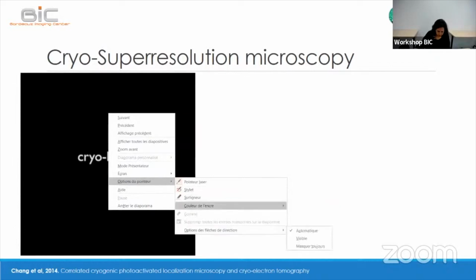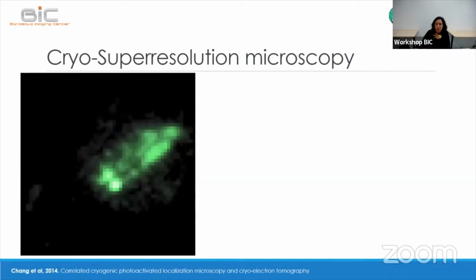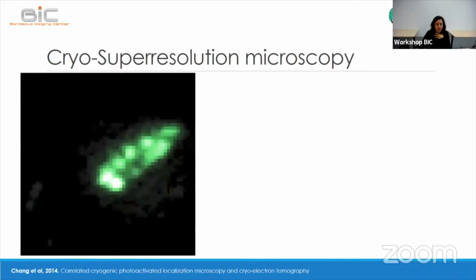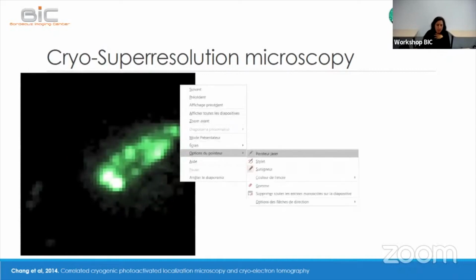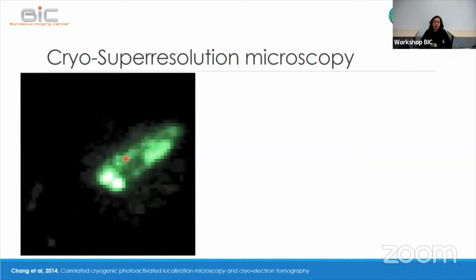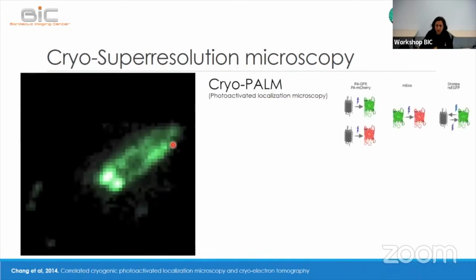No, I cannot control the video. So anyway, in this case, what you have is the difference in the resolution when you express this protein. With this protein you can do cryo-CLEM because you can control the activation of this protein.